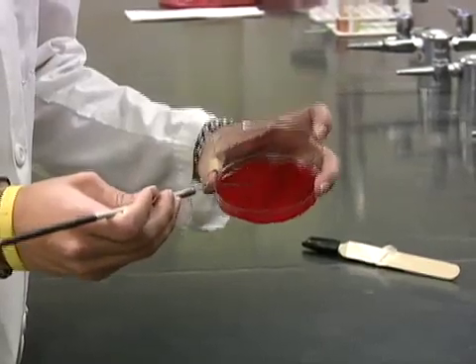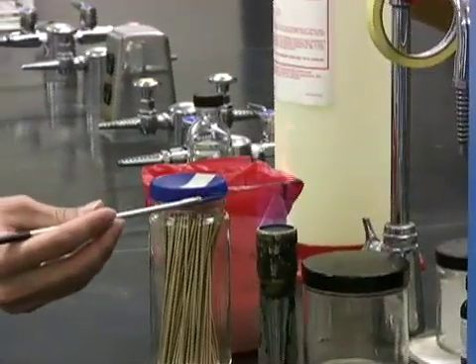Now it is the other student's turn. Complete the procedure, invert your plates, and place in the bucket for incubation.